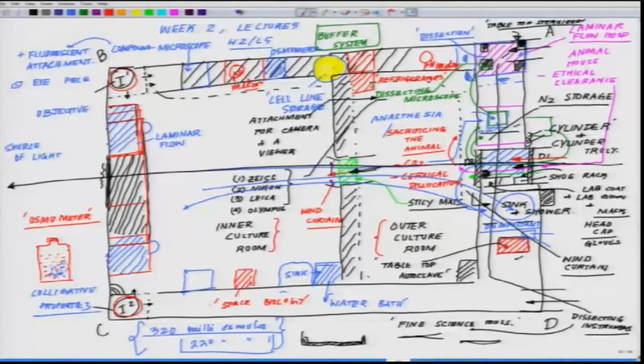Or say, for example, you wanted to create a certain situation of unusual extreme environment. Something like you want to simulate conditions of the poles, so North Pole, South Pole. So, you needed incubators of that kind where you can simulate those conditions.